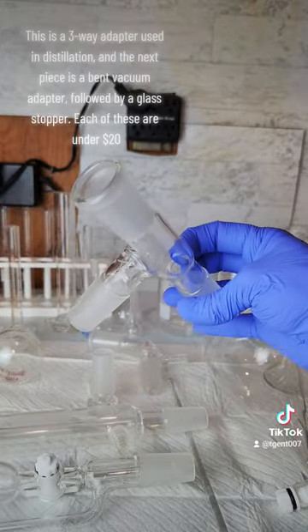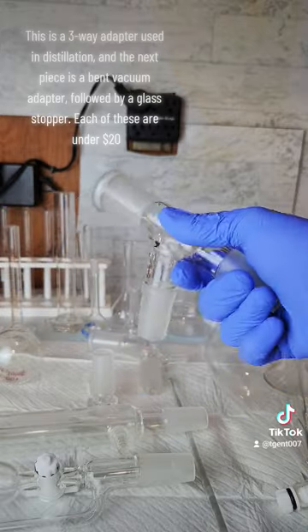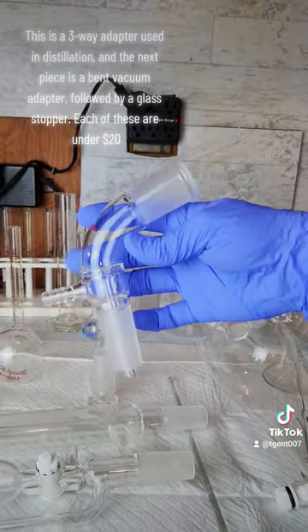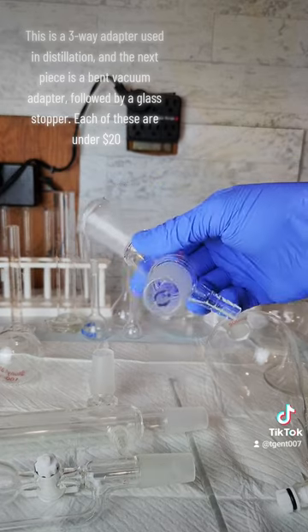This is a 3-way adapter used in distillation, and the next piece is a bent vacuum adapter, followed by a glass stopper. Each of these are under $20.